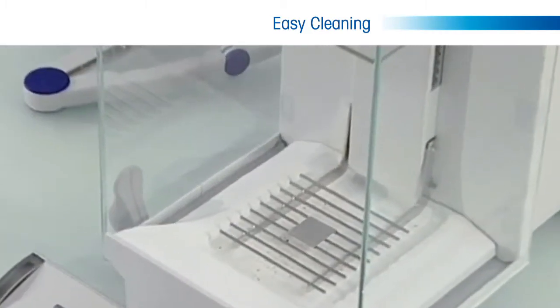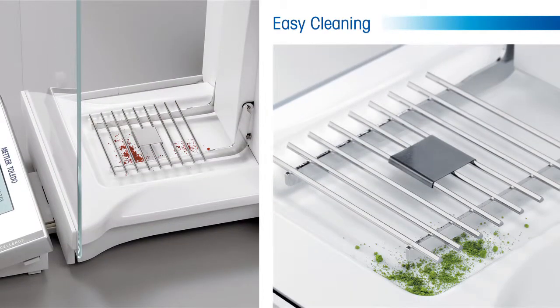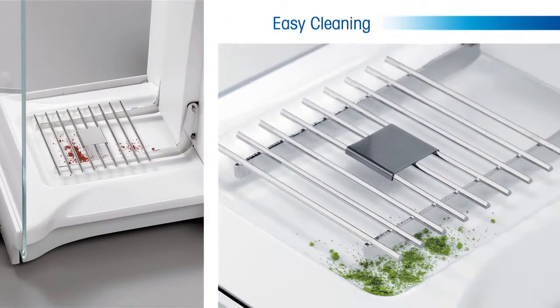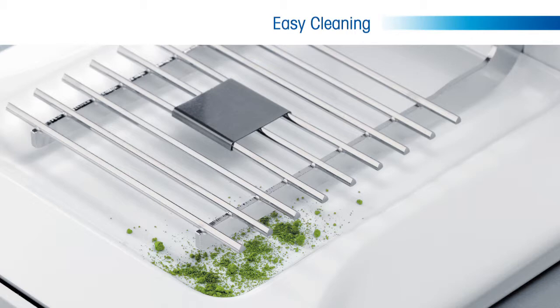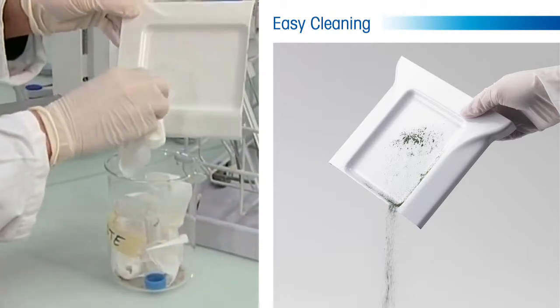The gridded weigh pan allows any mishandled powders or liquids to fall through the weigh pan and be easily collected in the chamber catch tray. Spillage does not affect the weighing process as it does with traditional balances, and any spilled sample can be easily cleaned at the convenience of the user.